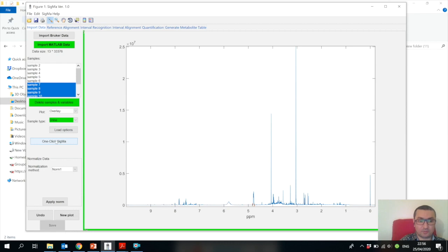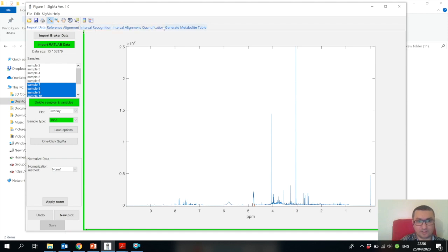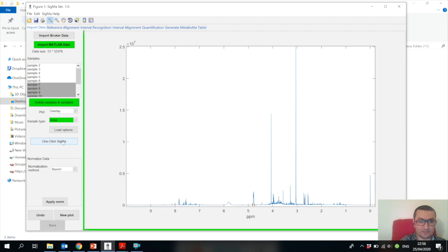What you can also do is if you have already used Sigma, you can load the options of Sigma and directly press One-Click Sigma. It will generate your metabolite table, so you don't need to go through all these tabs - reference, alignment, interval recognition, interval alignment, quantification, and generate metabolite table. You will not need to go through all this - you can just press One-Click Sigma.